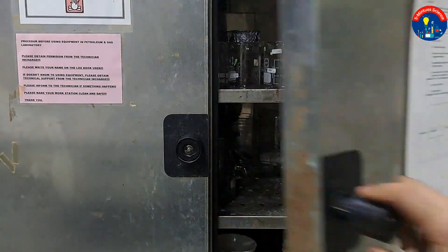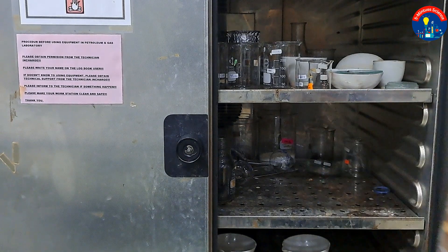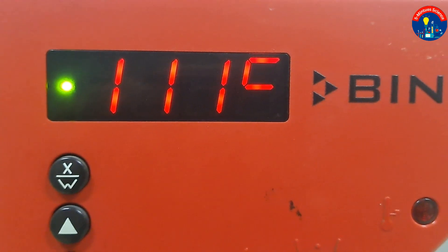Welcome to 5-Minute Science Channel. After taking the biomass as feed from the oven, typically recommended at 110 degrees, we mix it with a microwave adsorbent and transfer it into quartz.